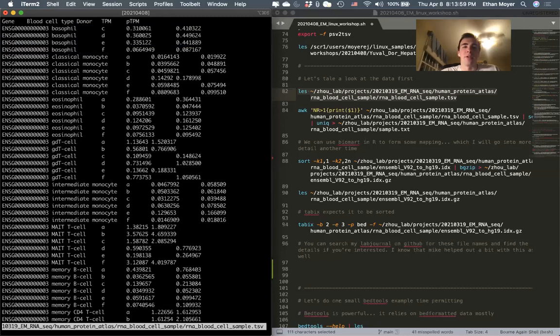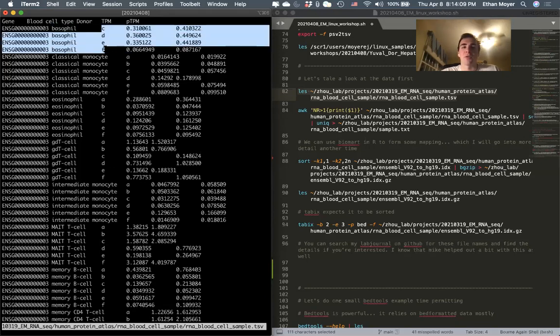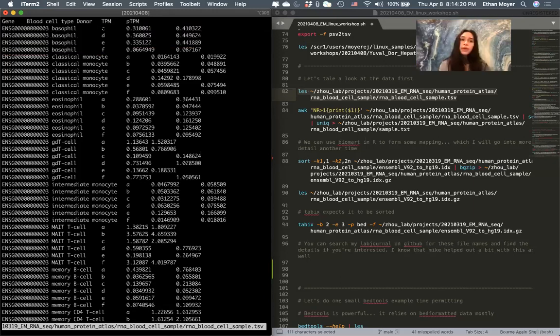You'd expect these values to be similar across trials because it's the same type of cell, but they're just biological replicates. I don't know if biological replicates is a good way to say it. They're basically doing 4 trials and 4 separate basophil cells. Oh, okay, that makes sense.